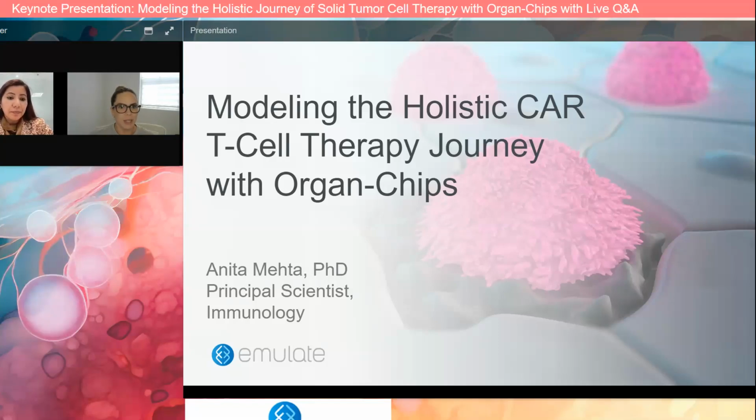All right, perfect. We have another here. It says, have you explored the use of other types of CAR T? For instance, have you tried targeting other antigens expressed by the cancer cells being utilized in this application? So that's the beauty of this workflow. It's adaptable. We have not tried internally any other targets other than CD19, which is a negative CAR that we used, as it's not expressed by the solid tumor. We did HER2, which is targeted towards the solid tumors. We have not done any other CAR-Ts.